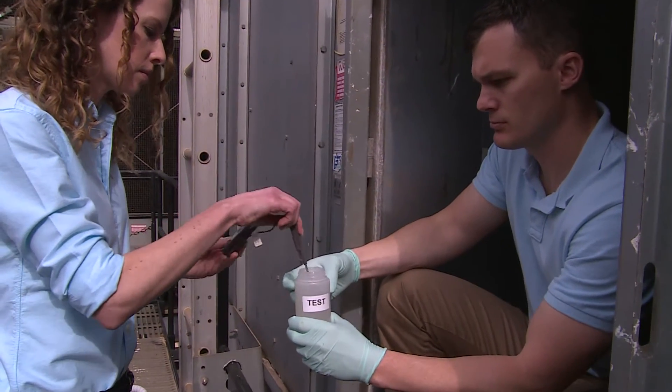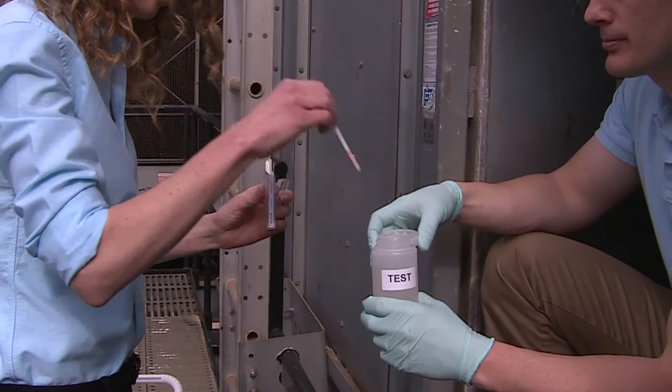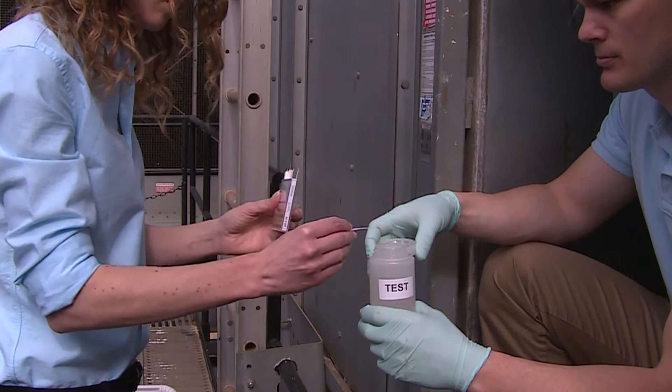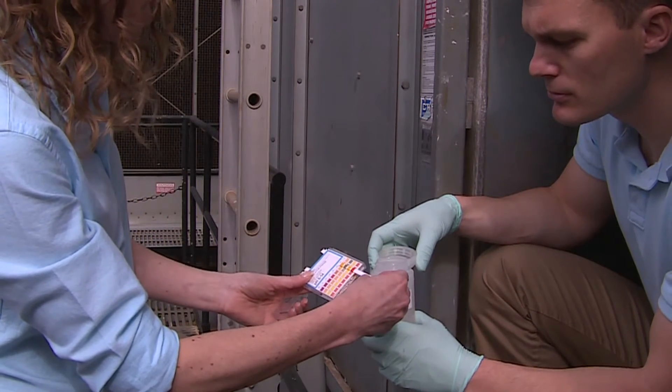Measure the water temperature, making sure there is enough time for the thermometer to stabilize. Measure pH by placing the paper strip inside the bottle and compare the colors on the paper strip with the legend on the box. Alternatively, you may use a digital pH meter.